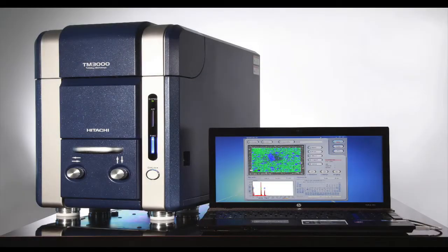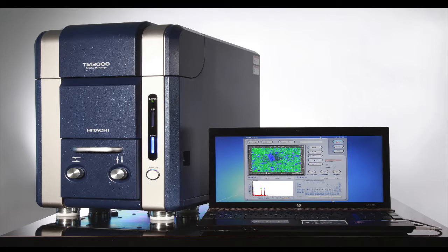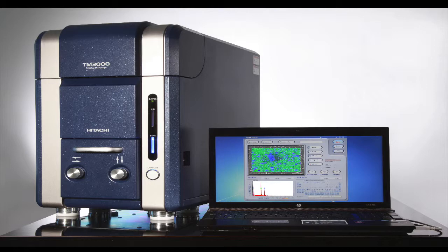So until now, if you wanted to see an electron microscope, you had to take a field trip. Today, schools are actually getting these Hitachi TM3000 tabletop electron microscopes loaned to school districts, museums, and communities. The TM3000 is a scanning electron microscope that has a touch screen, and we have one over here at the high school. We're going to go take a look at Mr. Boyer's nanotechnology class so he can give us a little demo.